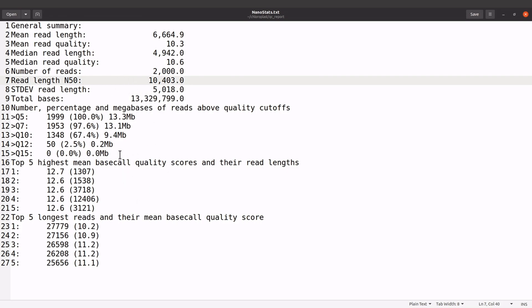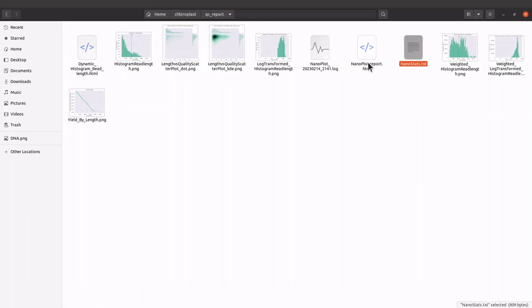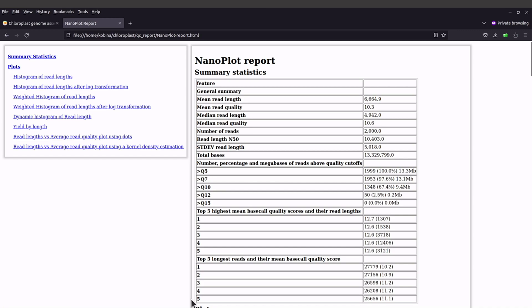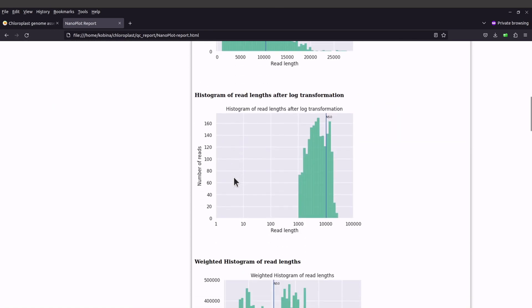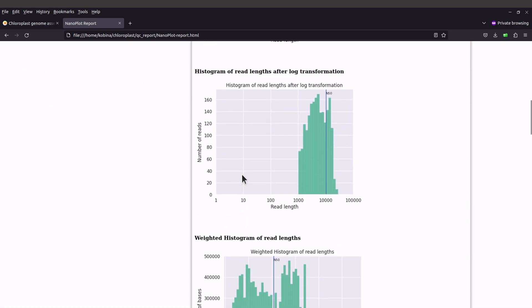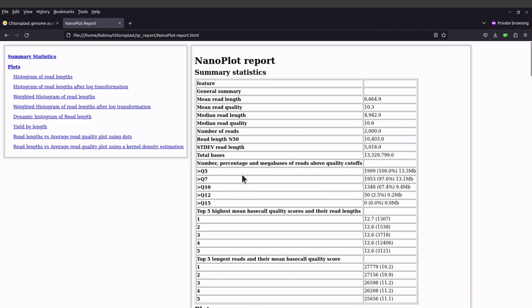You will have some statistics here that you can read through. But let's take a look at the HTML file — that is what we really want to do. This is the HTML report. It has information that we opened. You have some statistics here that you can use to assess the quality of your data and help you understand your data.